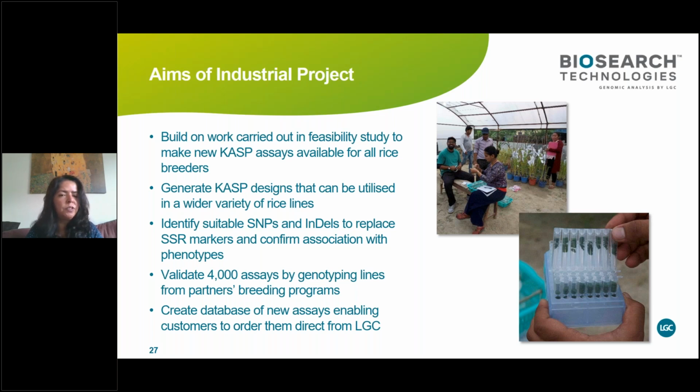We wanted to ensure that the 4,000 markers that were identified in the feasibility study were validated through our technology and through our service capabilities. And one final objective for the industrial phase was to develop a database which could be accessible directly from LGC. All of this I will go into a lot more detail momentarily.